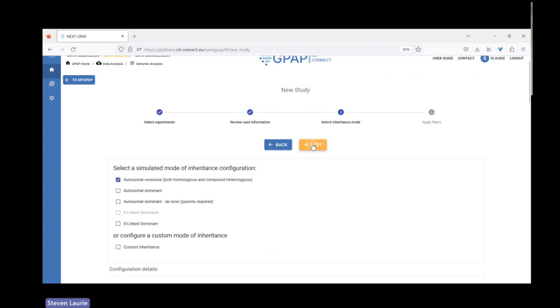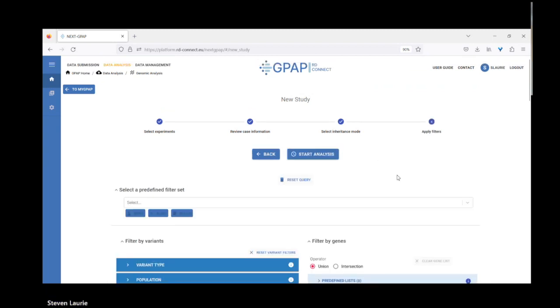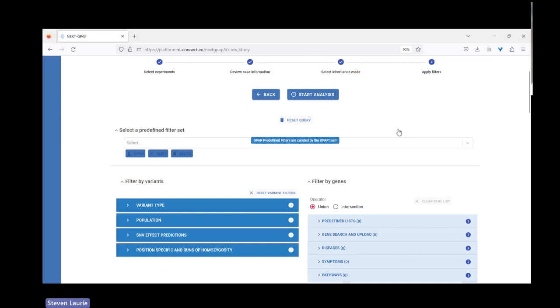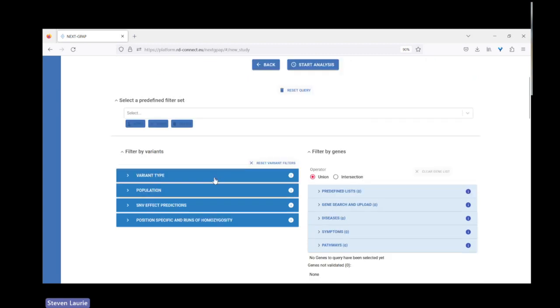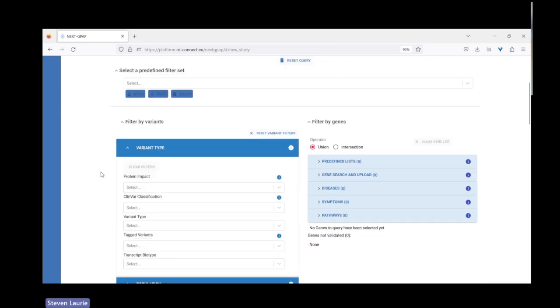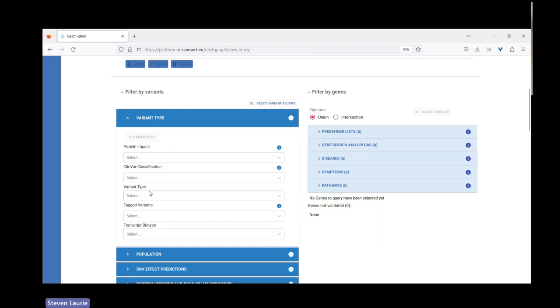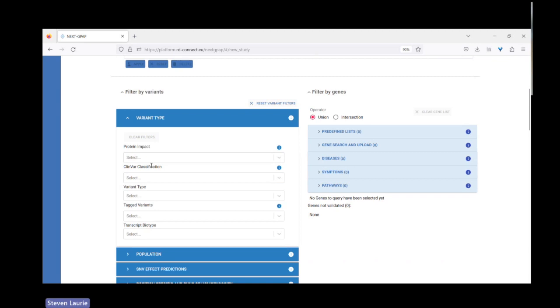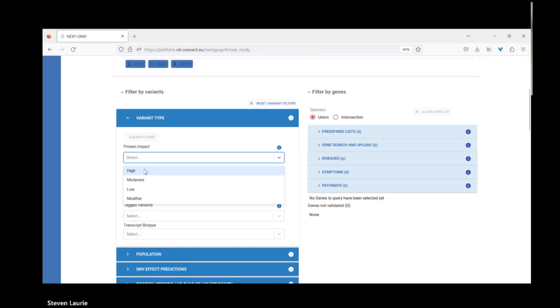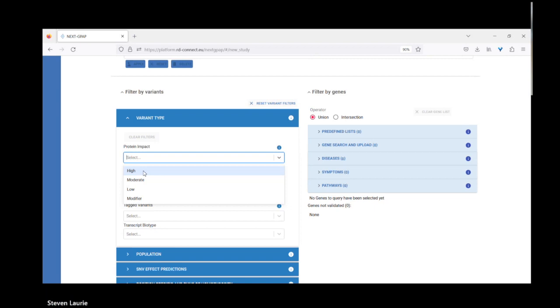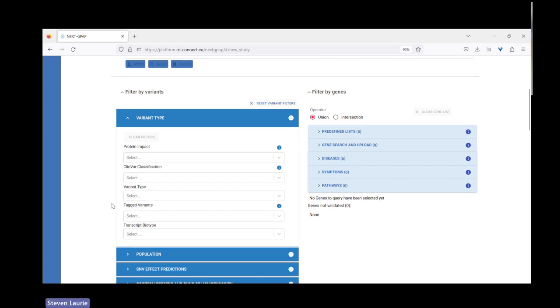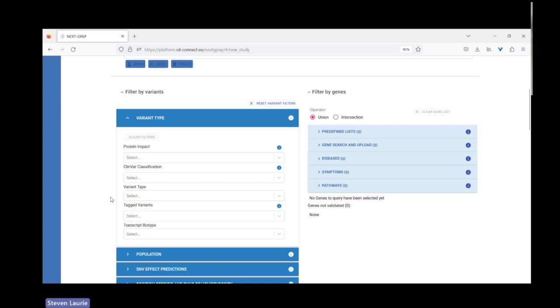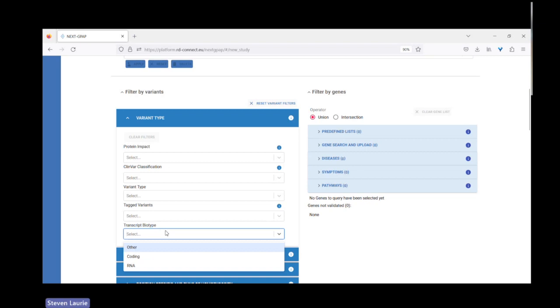When we select autosomal recessive now, we get both the simple homozygous autosomal recessive, but we also get the compound heterozygous filters. We assume the parents are carriers with one reference allele, one alternative allele, and that the affected child is homozygous for the alternative allele. There's some quality settings that can be adjusted here. Essentially, we're asking for a depth of at least 10 reads covering any position that we're investigating, and a genotype quality of 30.